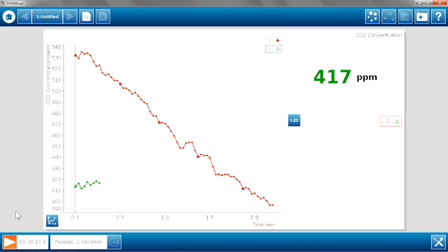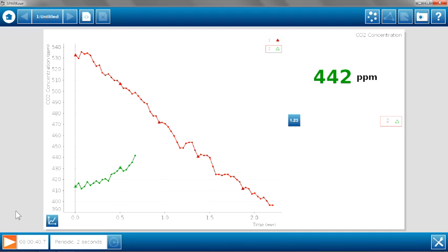Again, you can see the data points being collected on the graph display, as well as the digit display changing as well. You can have students predict prior to beginning data collection for run two what they think will happen when the plant is in darkness, and then you can ask them as the data is being displayed on the screen whether or not that matched the prediction that they had in their mind to start with. So you can see that the carbon dioxide sensor shows a change in carbon dioxide concentration due to photosynthesis or in this case cellular respiration very quickly and with a simple setup that is easy for students to perform.